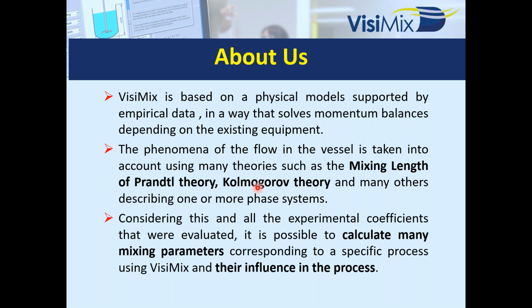For instance, for the distribution of solids, we will require the concentration of the solid, the particle size, and the density of the particle. For the reaction, we will require a good starting point: kinetics of the reaction that you can obtain with different equipment, and you can run in a very typical laboratory where you are taking samples of concentration of the material as a function of the progress of the reaction.